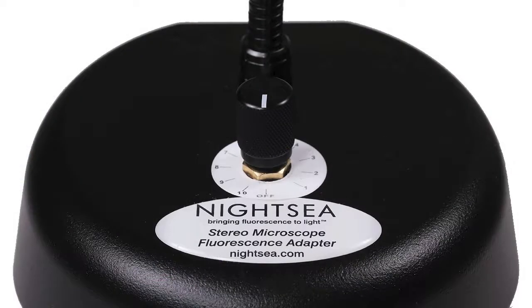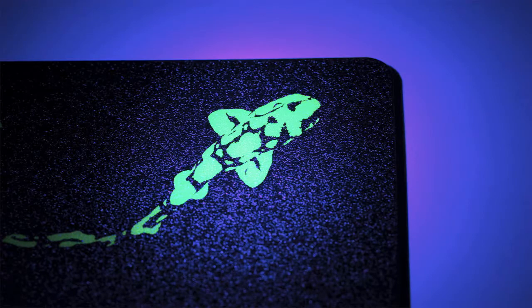The dimmer option replaces the SFA's on-off switch with a new switch that includes an intensity control function. It enables you to reduce the excitation to about 30% of maximum.